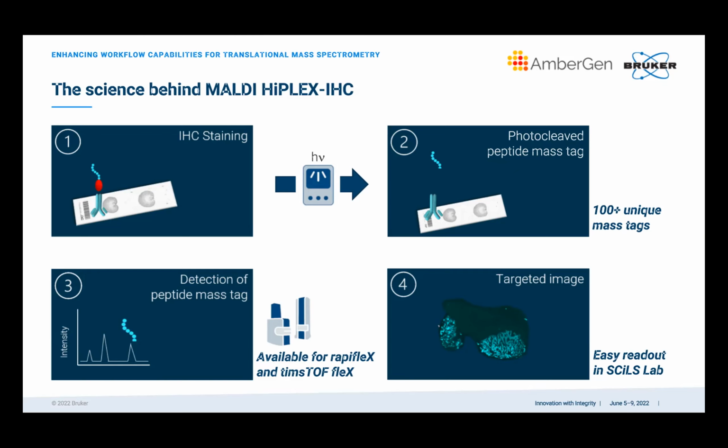I sort of have a general question. One of the things we struggle a little bit with in single cell RNA-seq, for example, is that the cost prohibits replicating, so there are not lots of biological replicates. When you get down to the sensitivity of these single cell analyses, what's the technical variability? I guess you can't really do technical variability on single cells, but what kind of variability is there at that level? So that's a very interesting question, and we're learning as we go.